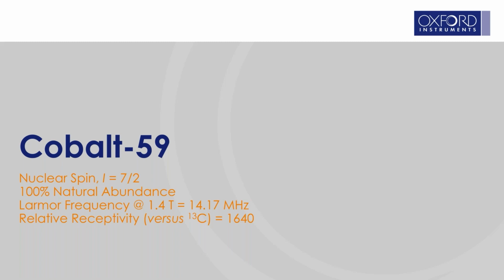As I alluded to earlier, one of the early applications of nuclear magnetic resonance was for the accurate measurement of the gyromagnetic ratios of the different elements and their isotopes. When cobalt complexes were first studied, remarkably large differences in gyromagnetic ratios were observed between different cobalt complexes, significantly greater than observed for other nuclei, or that could be readily explainable by the limitations of the early generation NMR instruments. It was this variation that was termed the chemical shift.